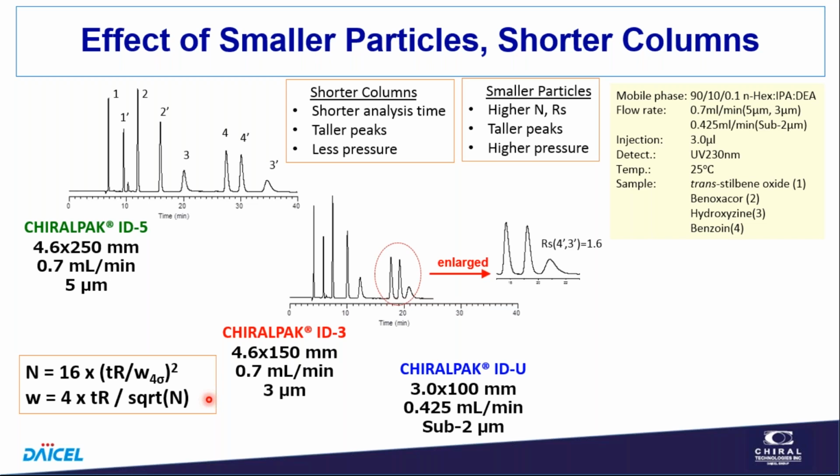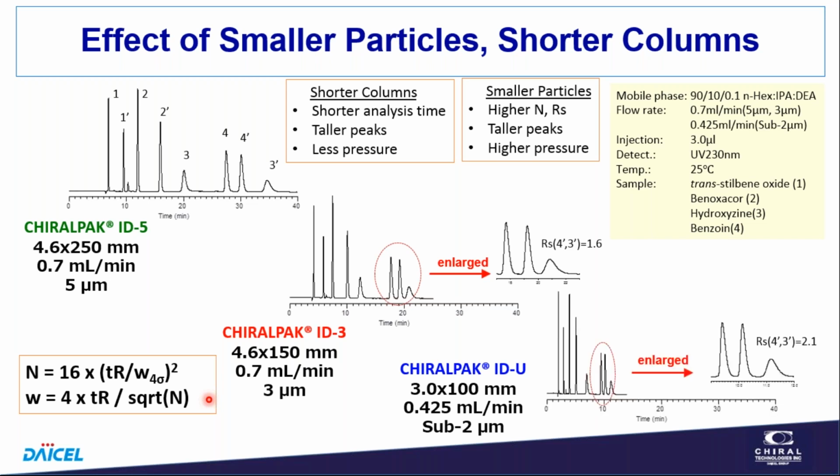And that's often discussed in fundamental books on chromatography. If you want to discuss it, I'd be glad to talk to you about it. And I will say I've had discussions with people who are very good chromatographers who have had to think this through, because it seems intuitive that longer columns should give you a higher column efficiency, and therefore the peaks will be sharper.